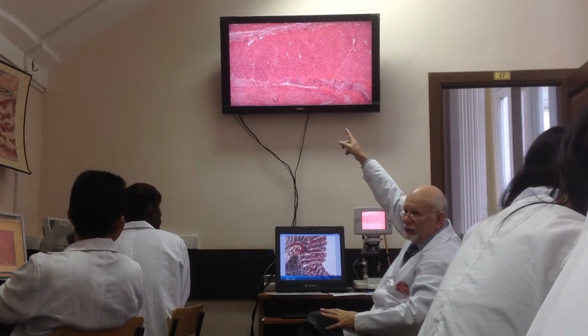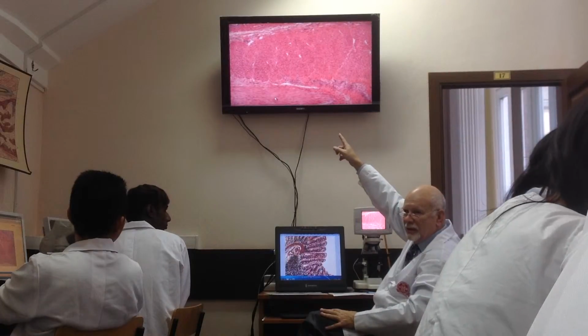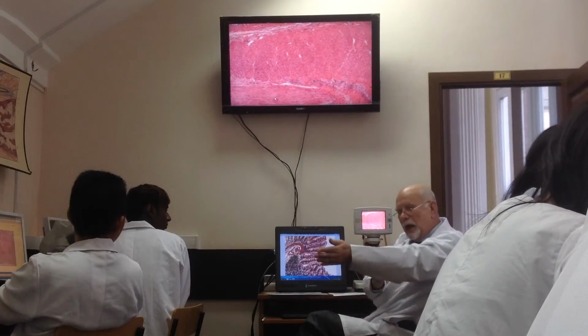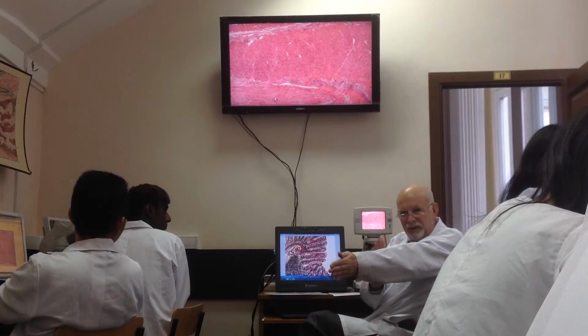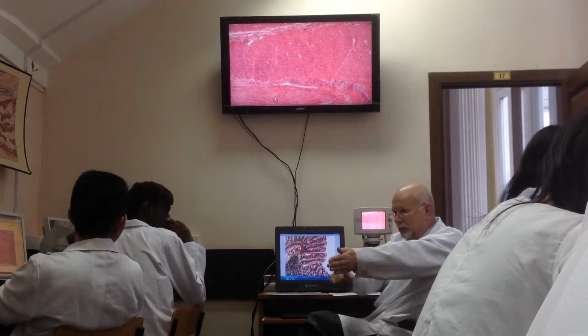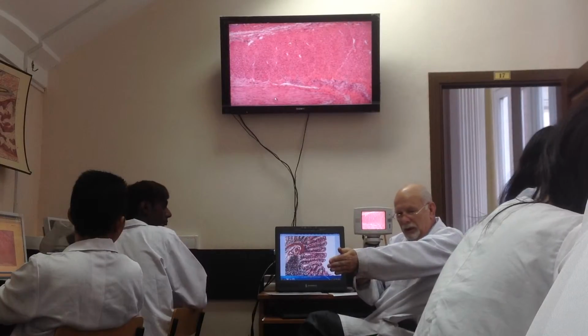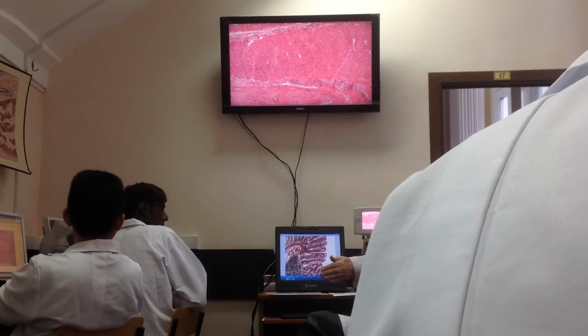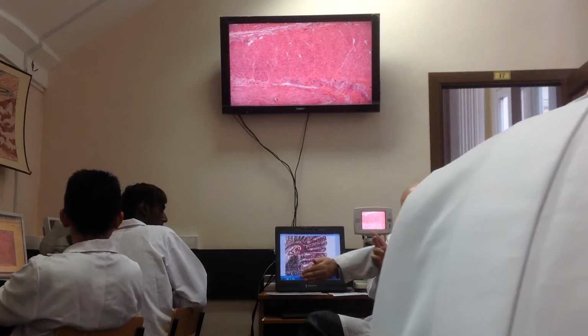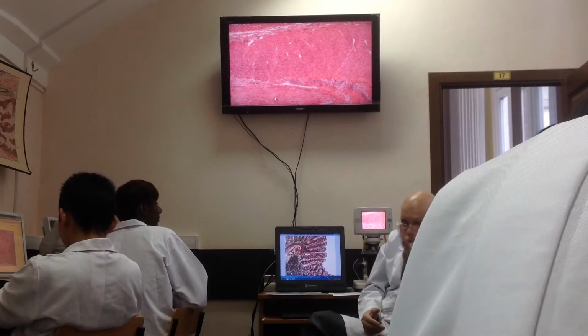And above you see the cells are cut across. And now imagine when you cut along the specimen, the external cells will be cut along, and the internal layer will be cut across, because cells are in circular position. Is that clear? Yes.